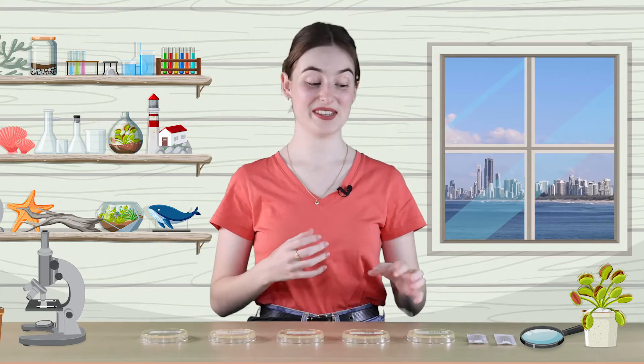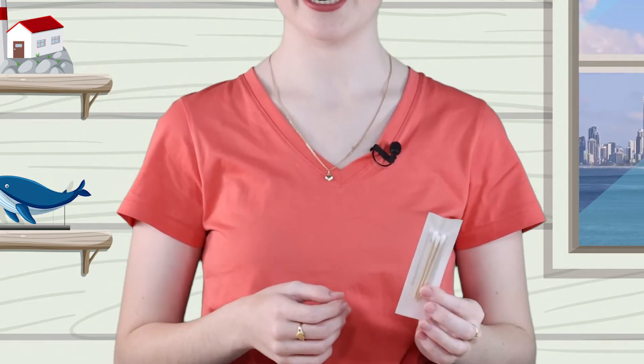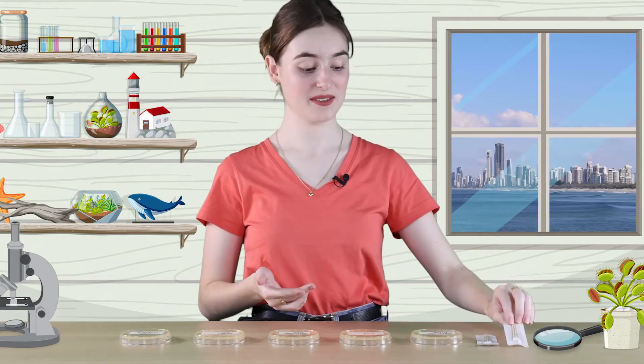We'll use these sterile cotton swabs to wipe the bacteria onto the agar plates. Agar is a mixture of nutrients that bacteria loves to eat. It helps them to reproduce and grow.